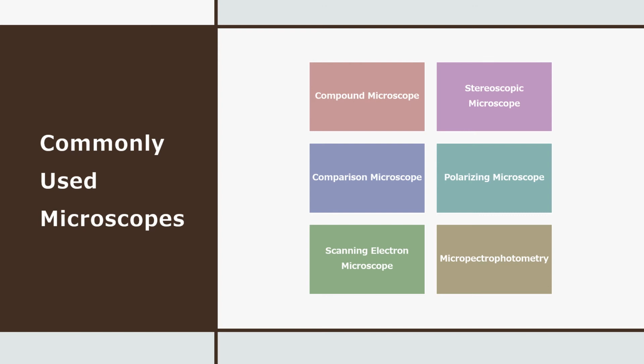Stereoscopic microscope, also known as a dissecting microscope. Forgive me if I just default to calling it a dissecting microscope going forward. I do tend to use that term more often since my background is in biology.